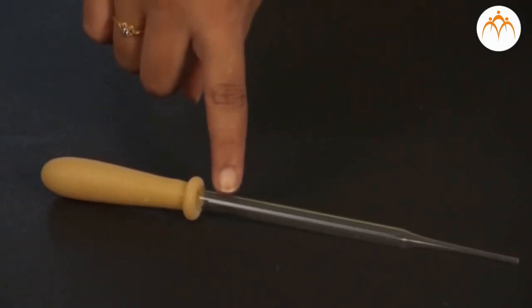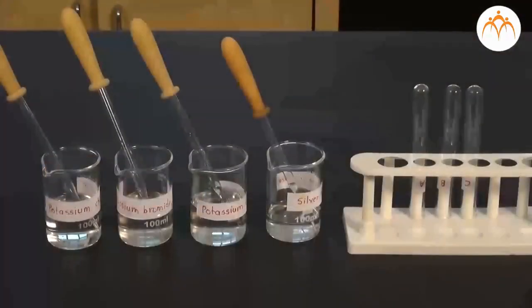Three powders are given which look similar in nature. They are all white crystalline powders. They are powders of potassium chloride, potassium bromide and potassium iodide. For the experiment normally, we don't take them in powder form. We take their water solutions.